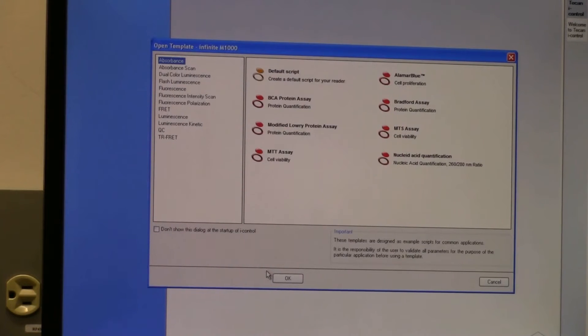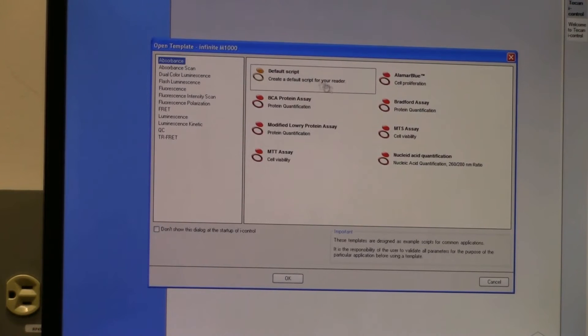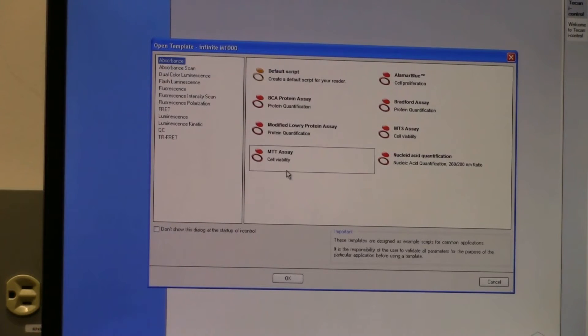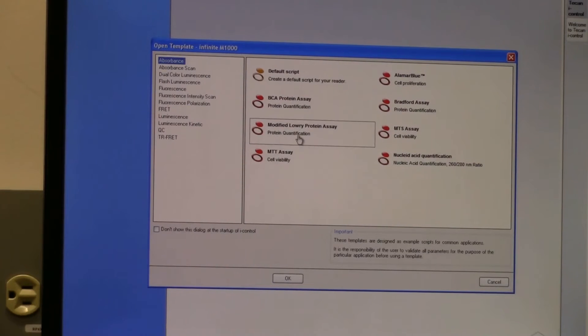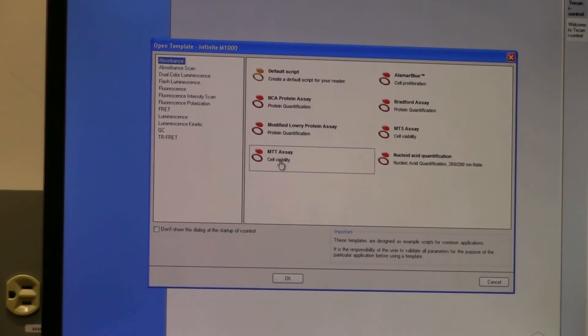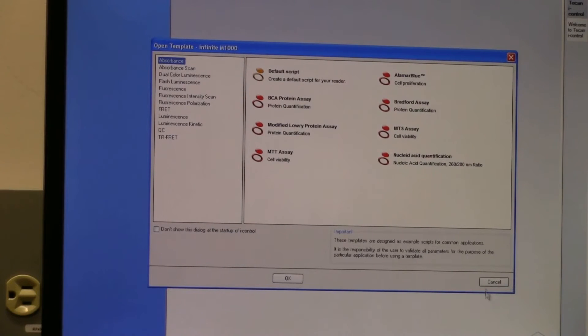Once that is done, this window comes up with just a bunch of different things - already loaded assays that you can click on if you want, if any of these fit what you need to do. Or you can just set up your own assay, so then you cancel out of this.